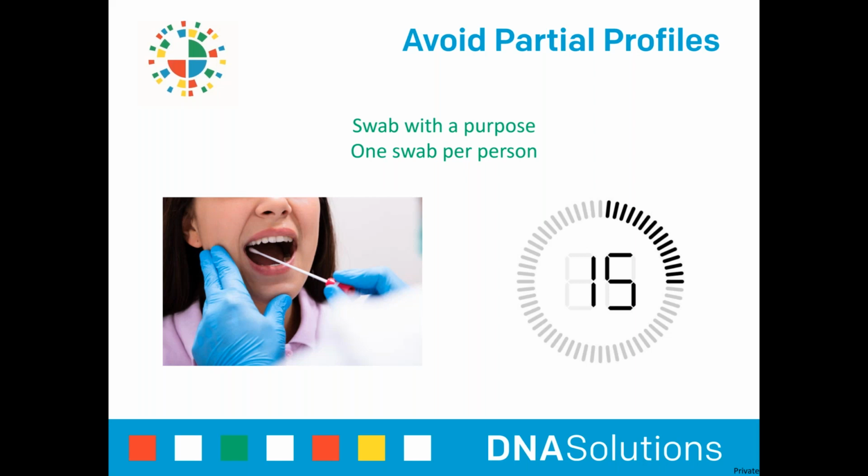If multiple swabs are present and the swab chosen does not produce a profile, we may contact you about testing one of the subsequent swabs. However, replacement sample fees would apply as well as additional processing time. Swabbing intently for a minimum of 15 seconds while rotating a swab has a higher probability of providing a suitable sample for your client than submitting multiple swabs for testing. It is highly recommended to follow the standard of only one swab per person.